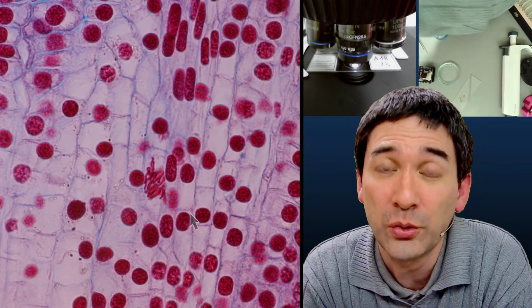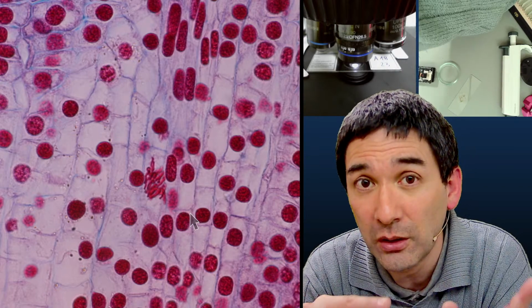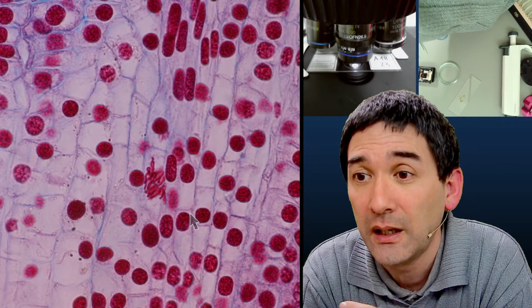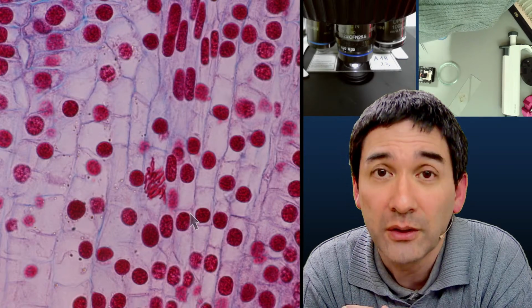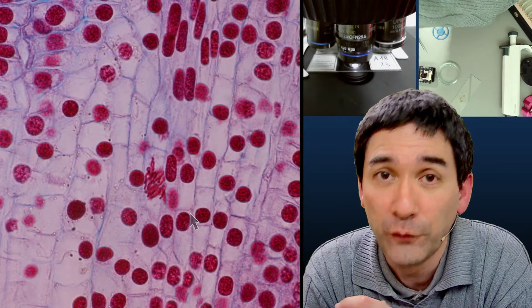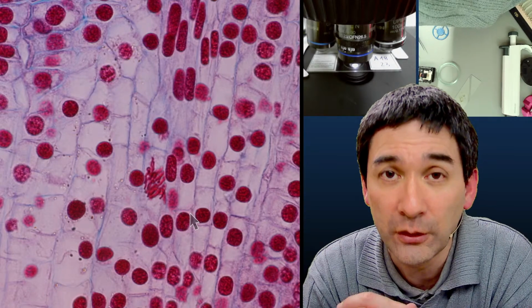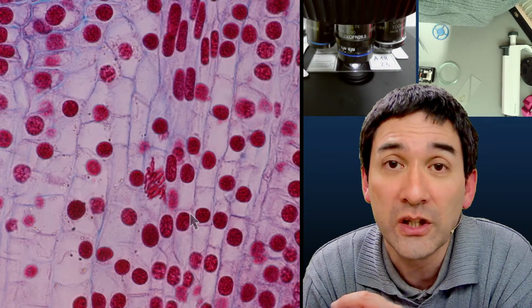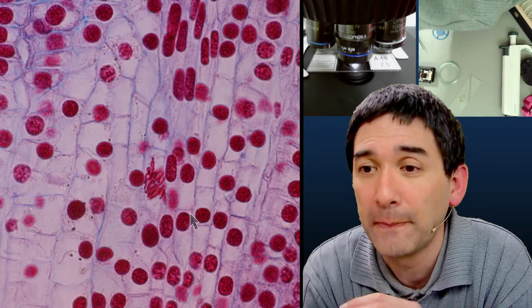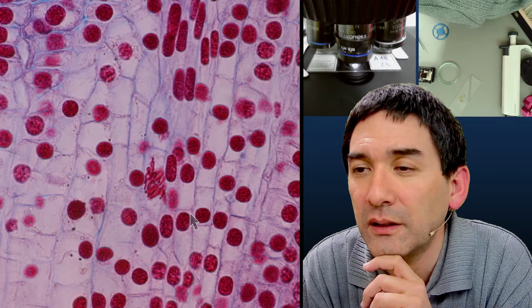Or you can also connect, many DSLR cameras have that, is you can also use the DSLR output of the camera to connect it to the computer. Okay, so there are different ways how you can do that, but I would first and foremost try out a mobile phone and try to download a program to install on your computer so that you can use your mobile phone as a USB camera. Okay, I would say that is one of the easier ways.